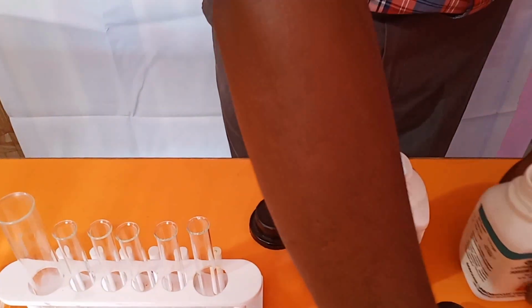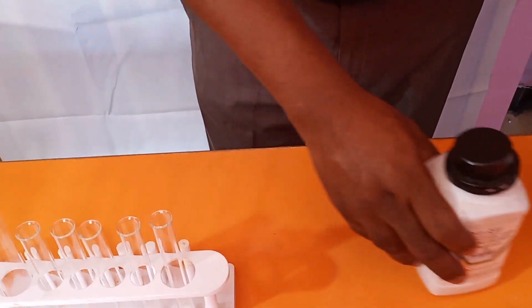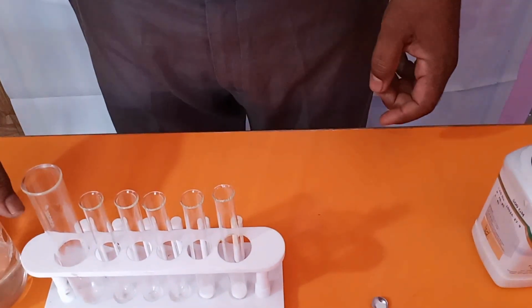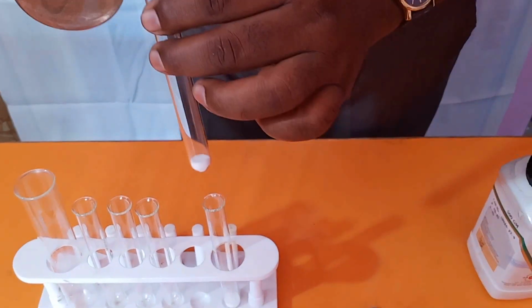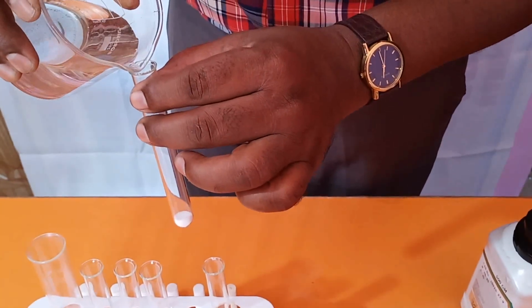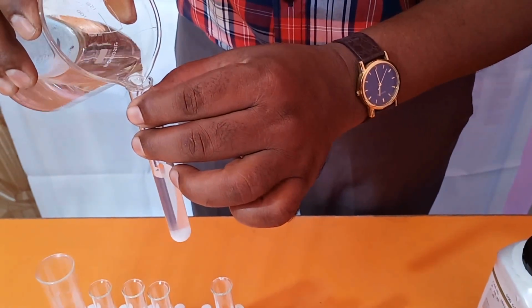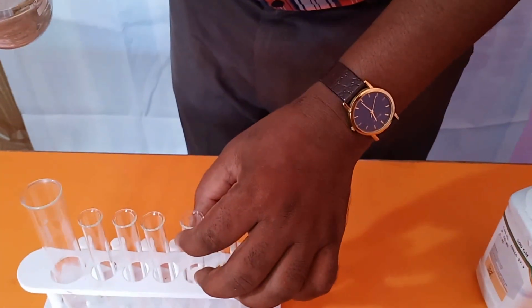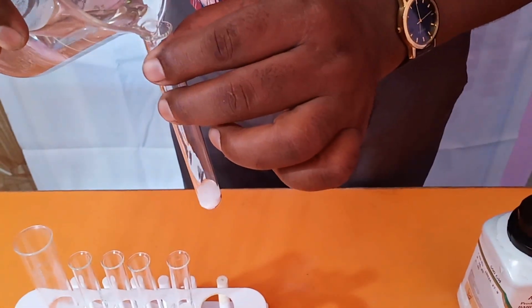Now what I am going to do is make the aqueous solutions of sodium sulfate and barium chloride. So this is the barium chloride aqueous solution, and this is the sodium sulfate aqueous solution.